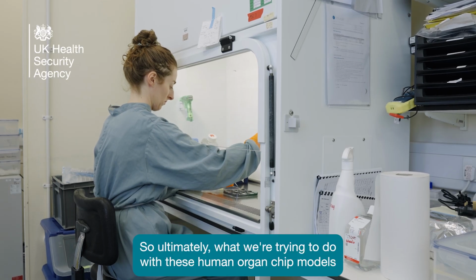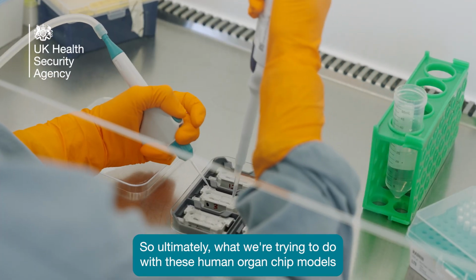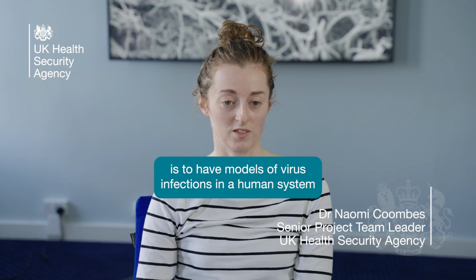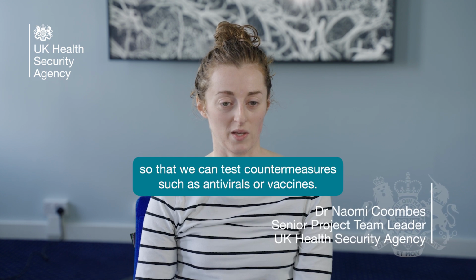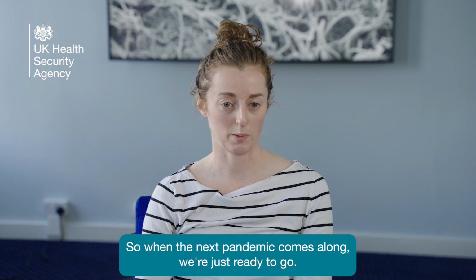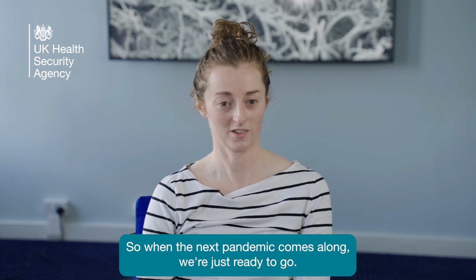So ultimately what we're trying to do with these human organ chip models is to have models of virus infections in a human system so that we can test countermeasures such as antivirals or vaccines. So when the next pandemic comes along, we're just ready to go.